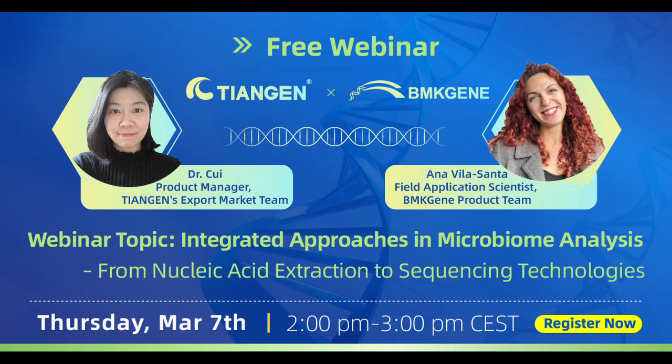Today, we'll explore integrated approaches in microbiome analysis, ranging from nucleic acid extraction to advanced sequencing technologies. Our webinar today is divided into two sessions. It will last for about 50 minutes, followed by a dedicated 10 minutes of your questions and answers. Feel free to submit your questions through the Q&A button at the bottom of your screen. We're eager to hear from you, and if any questions are left unanswered, we will contact you to reply to them via email. Additionally, we'll share the slides and a recording of this webinar via email.